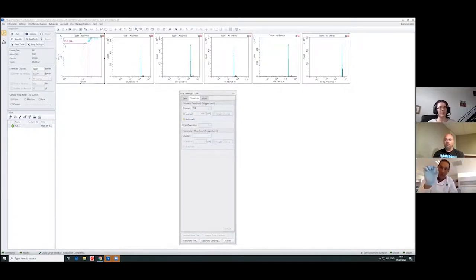We are changing from this to this. Because I know you read. We talked about reading literature, and in the literature for viruses, bacteria, everything, forward scatter doesn't get you much. You know that you have to go to some sort of side scatter property. And especially in this, we've noticed in our hands, the forward scatter really needs to be beefed up. It's not useful per se in this aspect of a threshold. I know that for certain. So we've moved away from that, and I'm sure you're going to talk about how you move away from it.